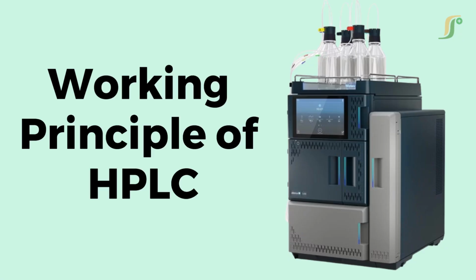Hi friends. Today, we are going to explore one of the most powerful tools in pharmaceutical analysis. High-performance liquid chromatography, or HPLC. Whether you are preparing for an exam, working in quality control, or just want to understand this better, this video is for you, so let us start.